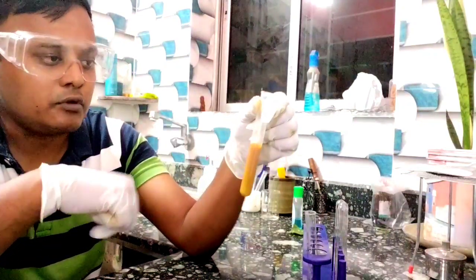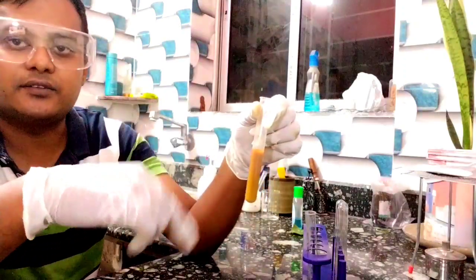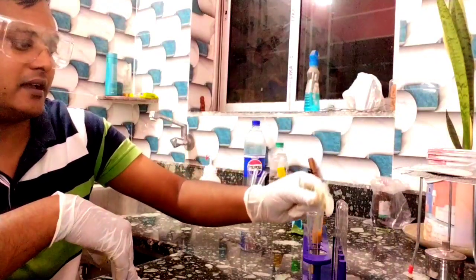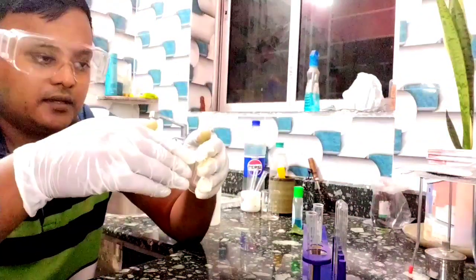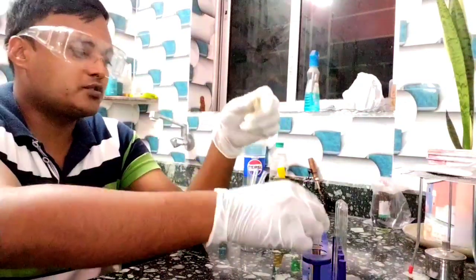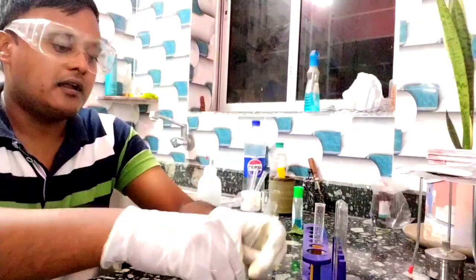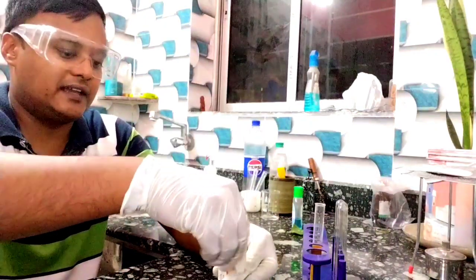Okay, we have to keep it for some time. Let's do the next one. Just keep it in the test tube rack for a few minutes to give the cuprous iodide time to settle down. Next one, in another CuSO4 solution, I'll directly add solid KI.